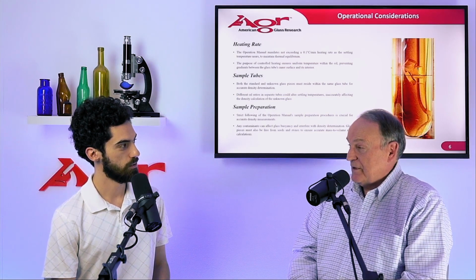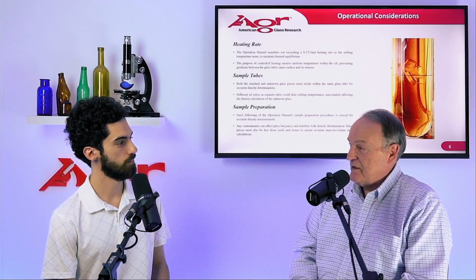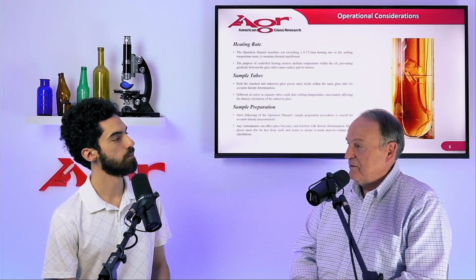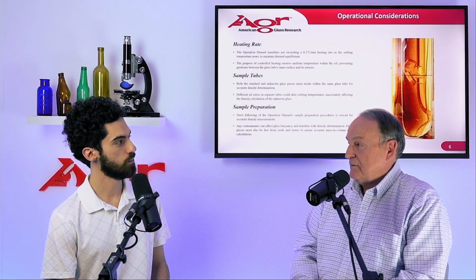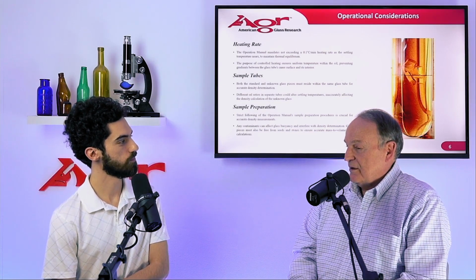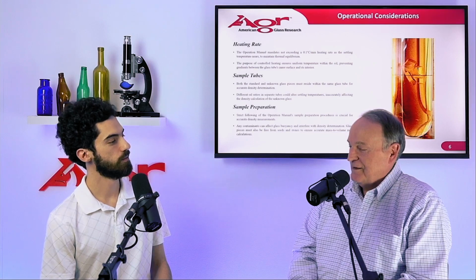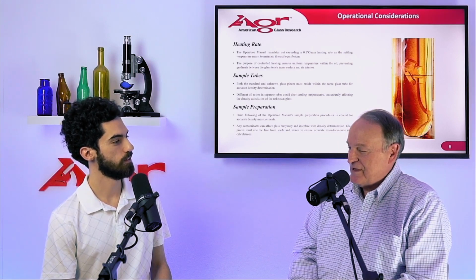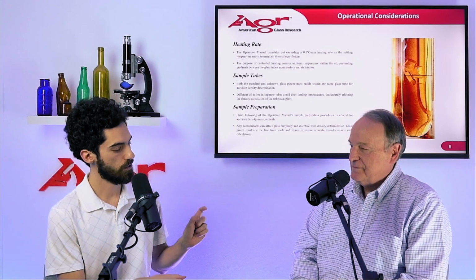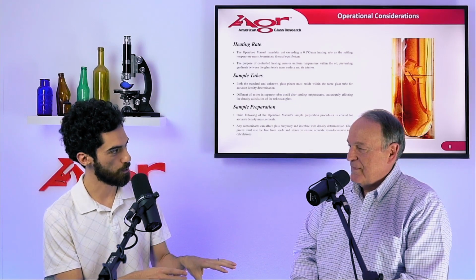Right. Now, when we supply sets of standards, we supply 5 pieces of glass whose density is very, very close to each other. So you could put one standard in each of those 5 tubes, one standard piece, and run all of the glass from, say, various furnaces you may have. And so you can optimize the utility of this device by separating out these standards. However, when you're measuring that temperature difference between the standard and the unknown, it has to be within that same tube. Okay, so parallel tests. Yeah. Standard, sample, one tube, another standard, different sample, another tube, and so forth.